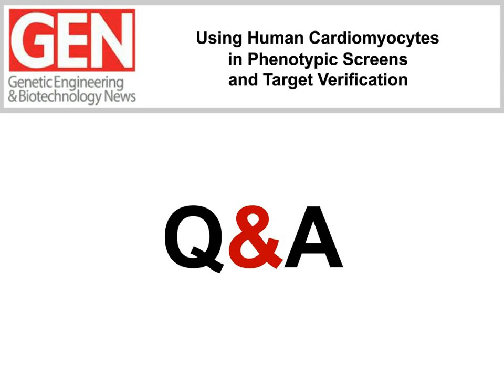Jason, does extracellular calcium concentration and beating frequency play a role in hypertrophy induction in vitro? And how are these parameters controlled? Yeah, extracellular calcium is interesting because it can affect the intracellular calcium concentration, which is really indicative of heart failure. So you can modulate the intracellular calcium and model certain cardiac diseases in that exact fashion.